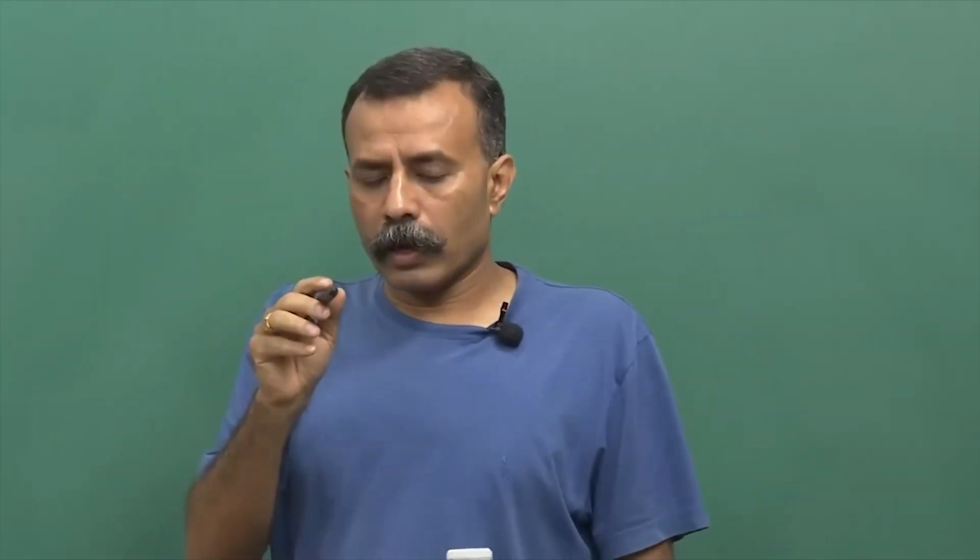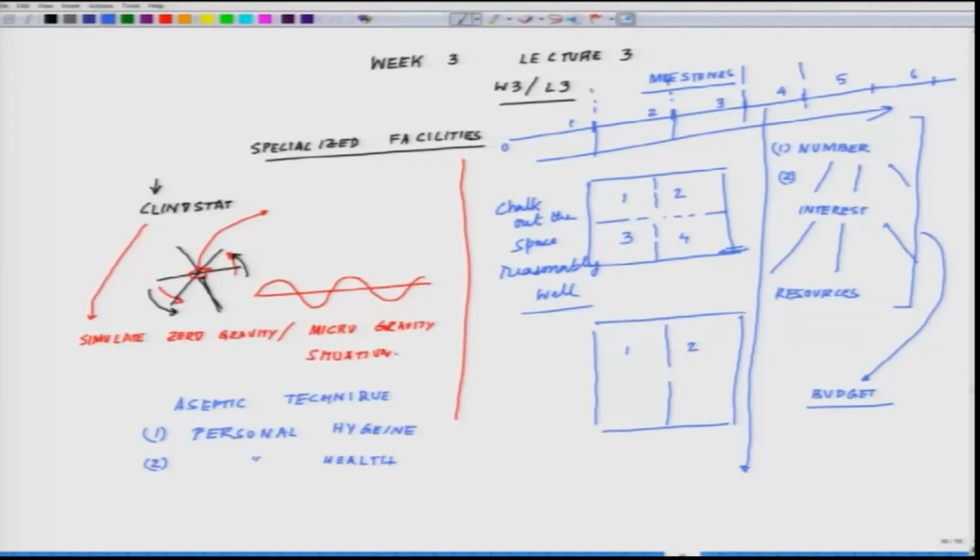So have, say for example, you have one incubator here, right? And of course, for that one incubator, you have a cylinder adjacent to it. So you have another incubator stacked on top of it. You have, say, 2 cylinders hooked up here, like this. I'll recommend you have 2 more standby behind them for the rainy days, because your friends will forget that these are about to end, and then you are hovering, running around, what to do. Don't allow that to happen. So have these backups ready.